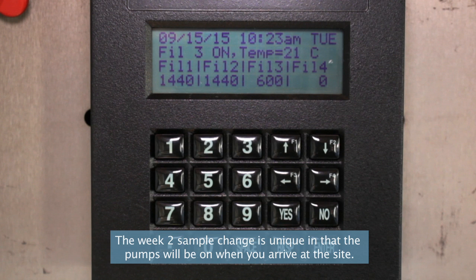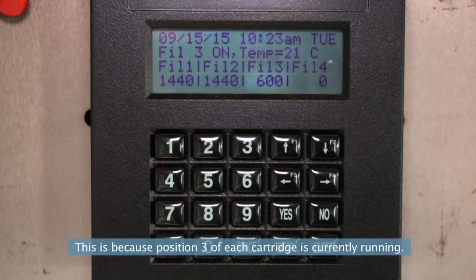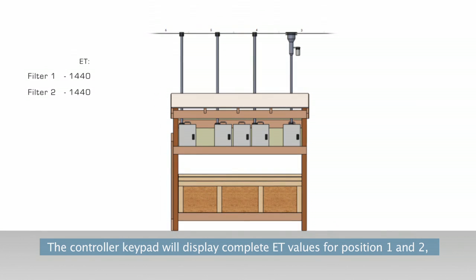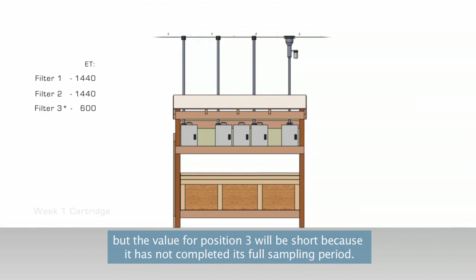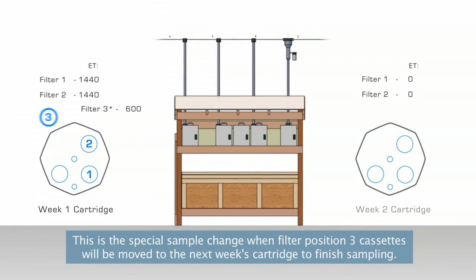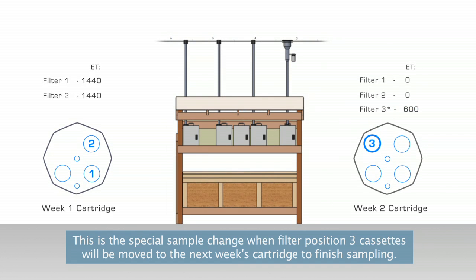The week 2 sample change is unique in that the pumps will be on when you arrive at the site. This is because position 3 of each cartridge is currently running. The controller will display complete ET values for position 1 and 2, but the value for position 3 will be short because it has not completed its full sampling period. This is the special sample change when filter position 3 cassettes will be moved to the next week's cartridge to finish sampling.